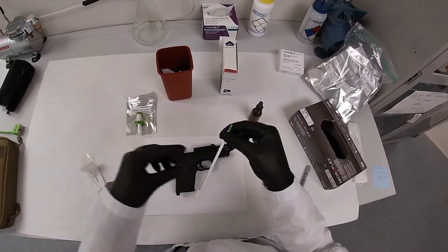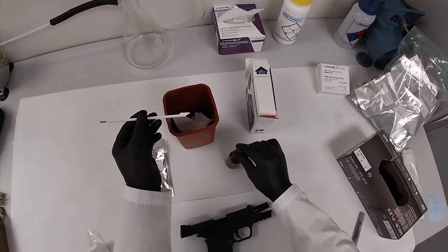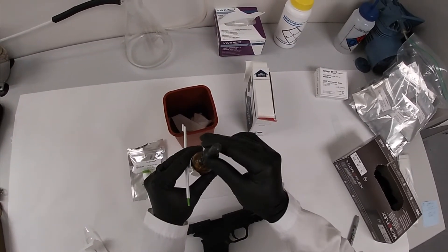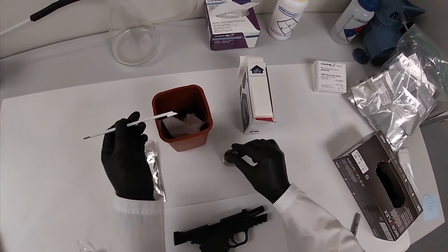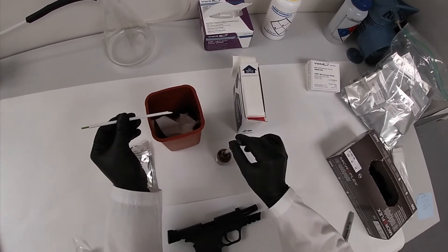If your application requires a wet swab, place a wetting agent like distilled water or 2% SDS from an ampoule on the edge of the swab. Be sure to only apply one drop of water when wetting the swab.